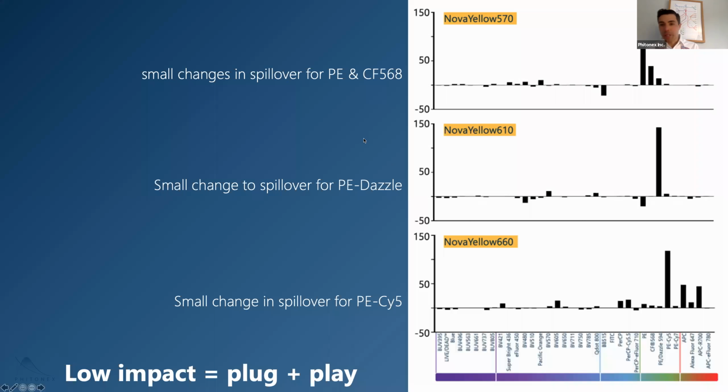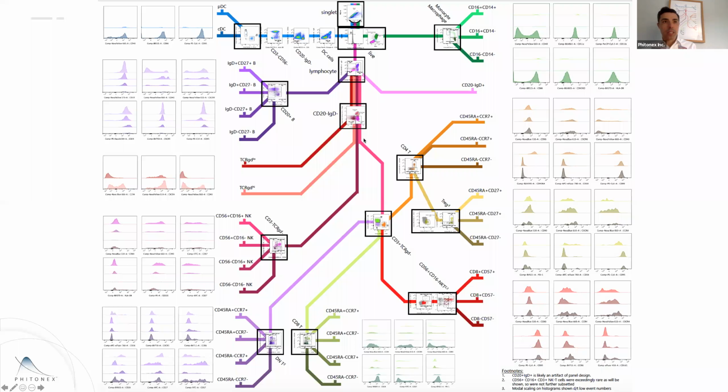So we did the phenotyping for this. We shared both the raw data as well as the deconvoluted data as well as the analysis on this. By the way, we will be doing that again, as crazy as that seems to people. So the second we analyze the data, we'll be posting up all of our data again. And I think the part that we're trying to drive to here is, I hate to say this, it's kind of like we're in this together when it comes to panel design. All of these things help us look at different perspectives on panel design, right?